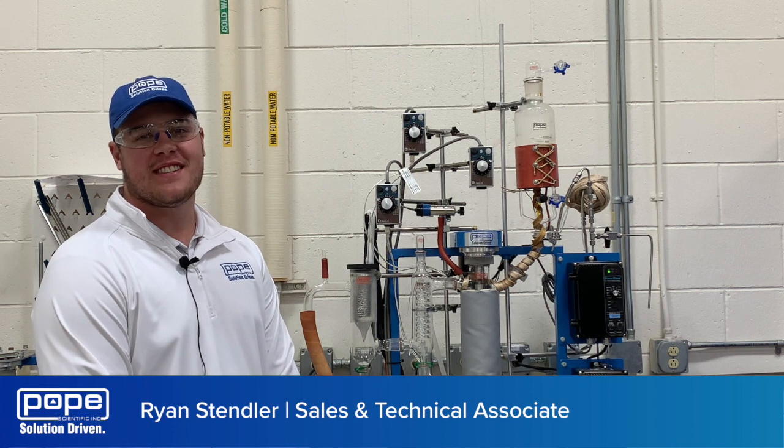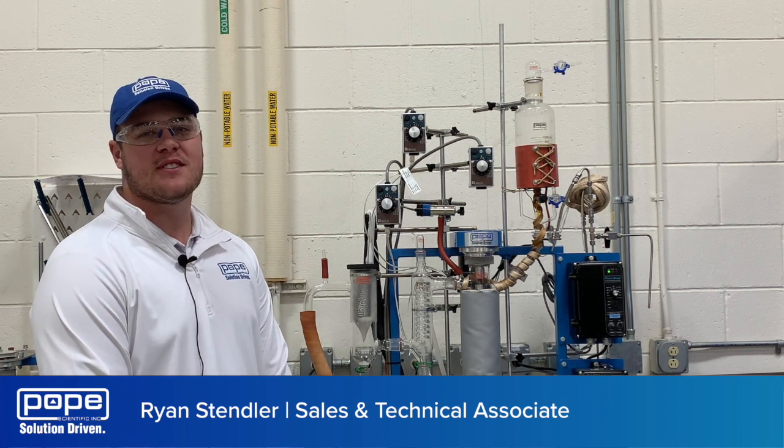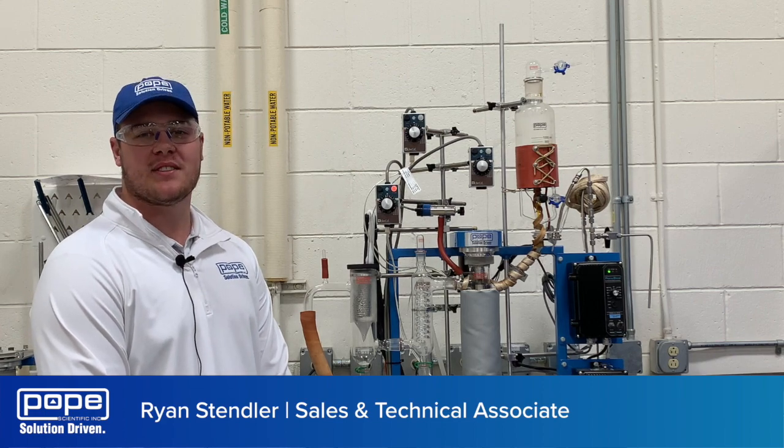Hi, I'm Ryan Stendler, Sales and Technical Associate here at Pope Scientific. Today I'm going to be showing you first and second pass on our Pope 2-inch white film molecular still.